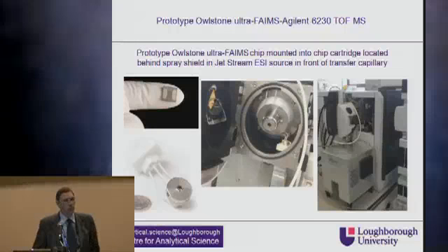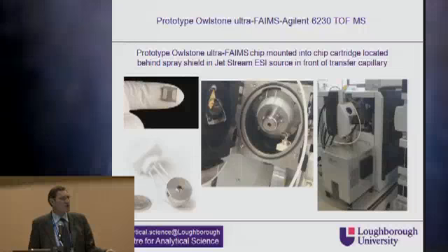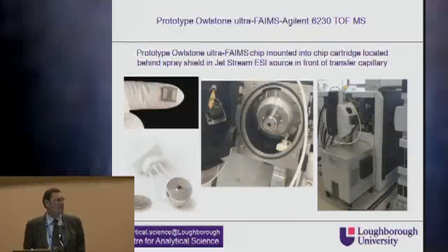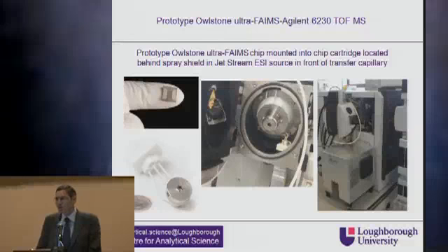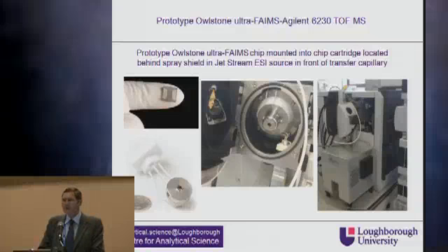And when you close the door on that, on the bottom right-hand side, there's an electronic control which is generating the waveforms, the DF and the compensation voltage fields, to operate the instrument. Now, everything I'm going to talk about in my presentation this morning, all the results, have been measured on this miniaturized chip-based system.